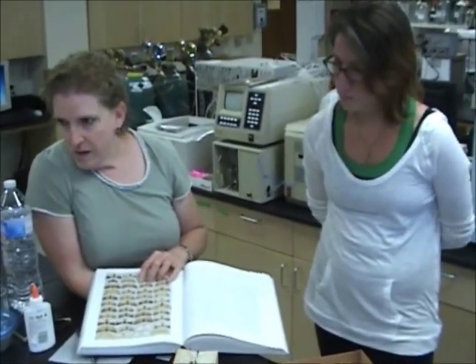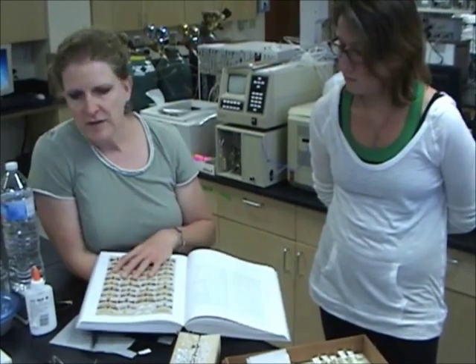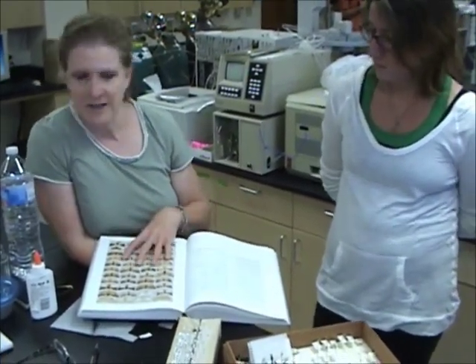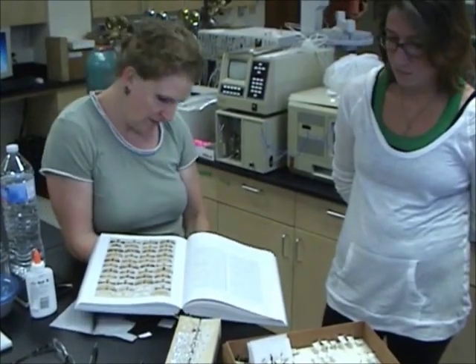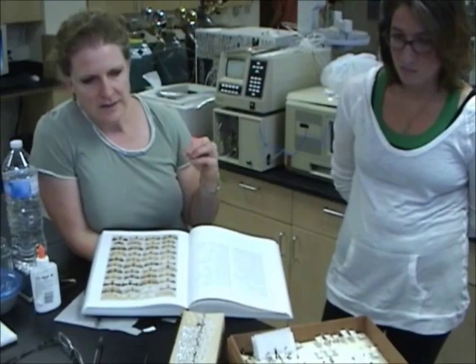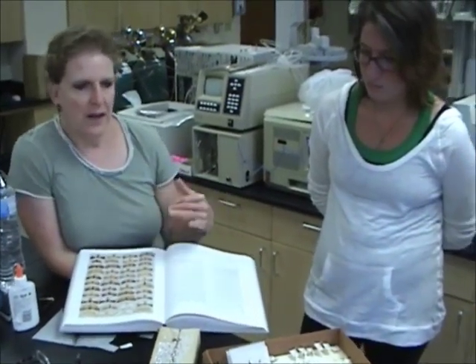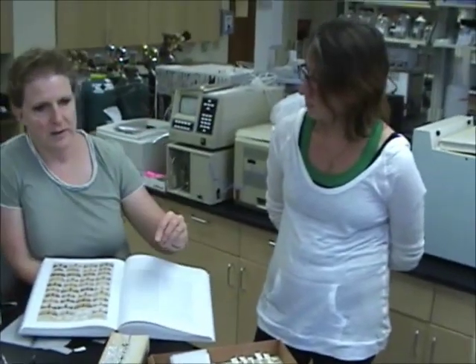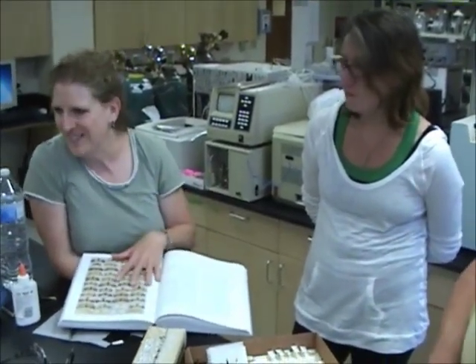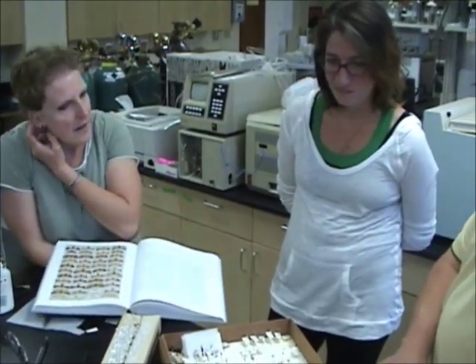How many examples of one species do you need? For some of these there are hundreds of what we assume is the same species. I think the goal is, for some of these being shipped back to Ecuador, they'll do ID work first and then say, okay, pin 25 of these, but we don't need 400. It hasn't been quite organized to that point yet.